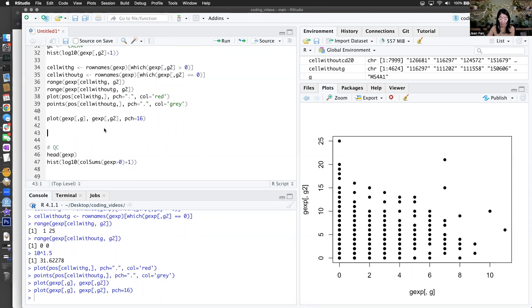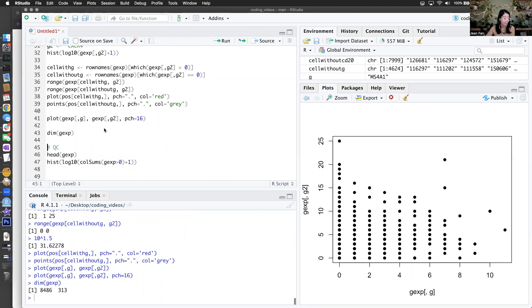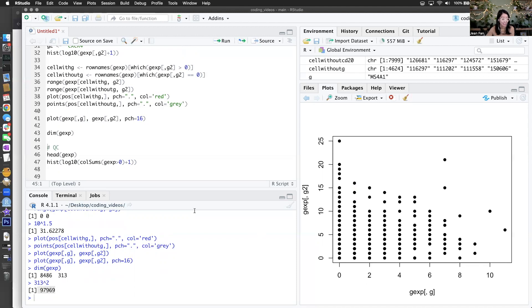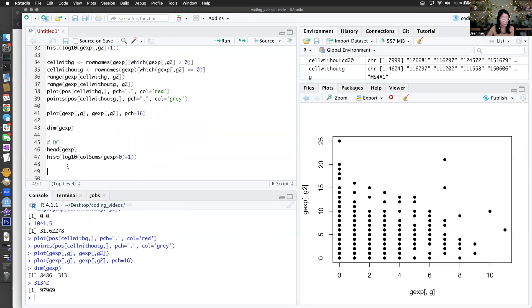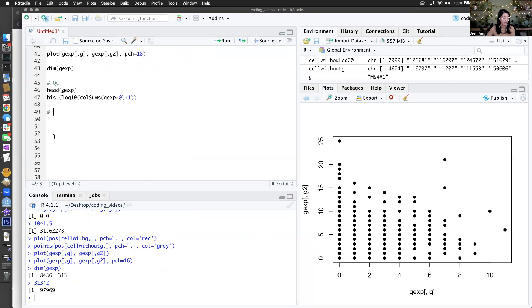Let's see how many genes there are. We're looking at about 8,000 cells and 300 or so genes. So if we wanted to make all possible comparisons, that would be a lot of scatterplots, and not just for these two things, but all combinations. So there's no way we're going to do all those visualizations. We're going to explore other ways of reducing the dimensionality — that's where we do principal components analysis.